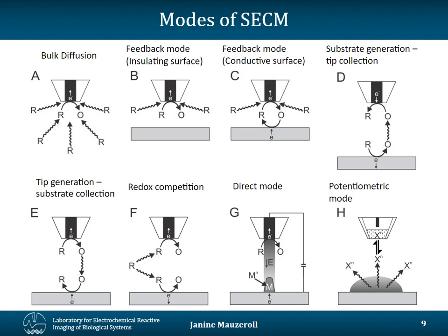And you have modes also that don't necessarily monitor the current. As I said, you have modes that involve the use of ion selective electrodes, which is presented in panel H as the potentiometric mode. So the point of this slide is to show you that in fact SECM is quite versatile and you can apply it to a wide variety of situations where your substrate is reacting or generating a species of interest.